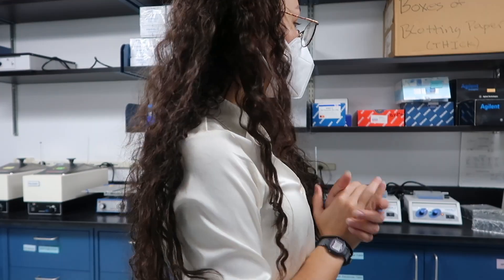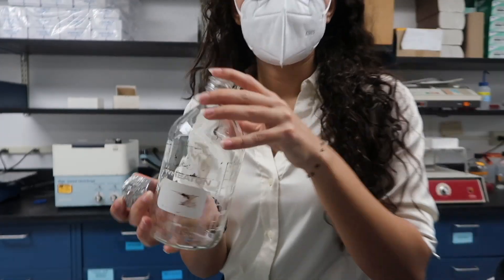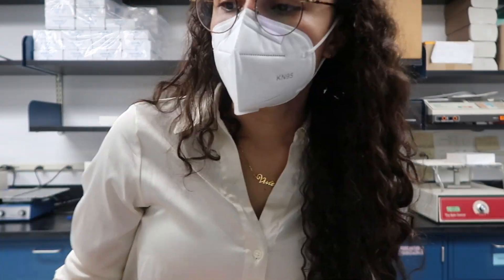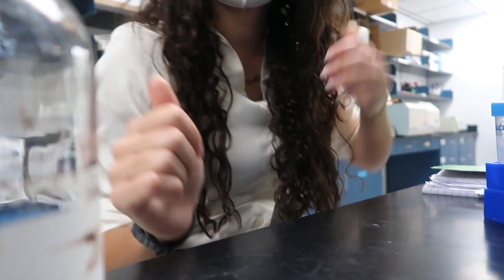Okay, so we got our slides and now we're going to start washes. I have to wash them with Tween. Okay, so I got my handy dandy bottle. We put stuff in tinfoil when we've baked it — you put stuff in this machine that makes it extremely hot and it kills like all forms of life. Where am I going to put you? Here, you're on my slide box.